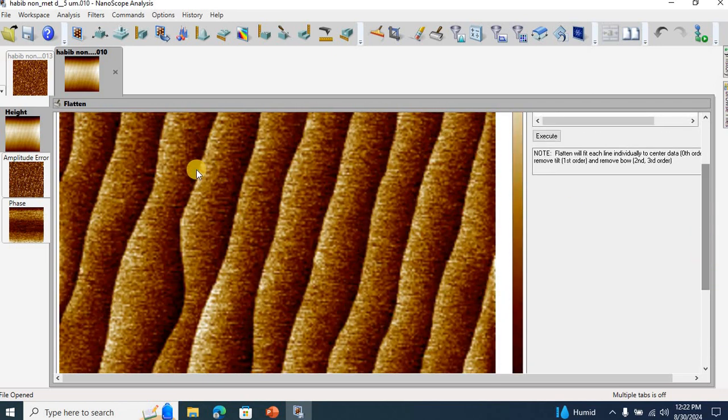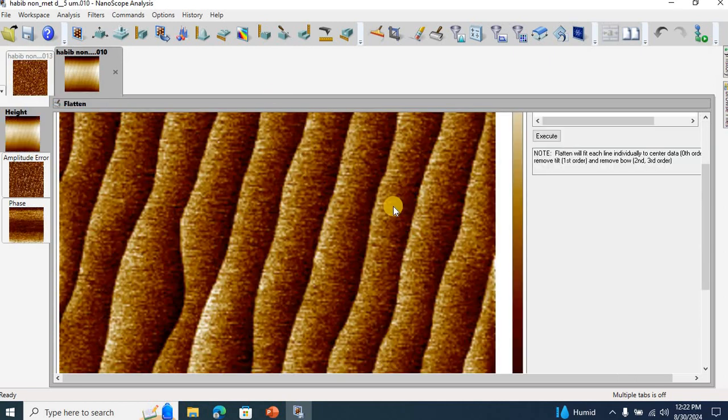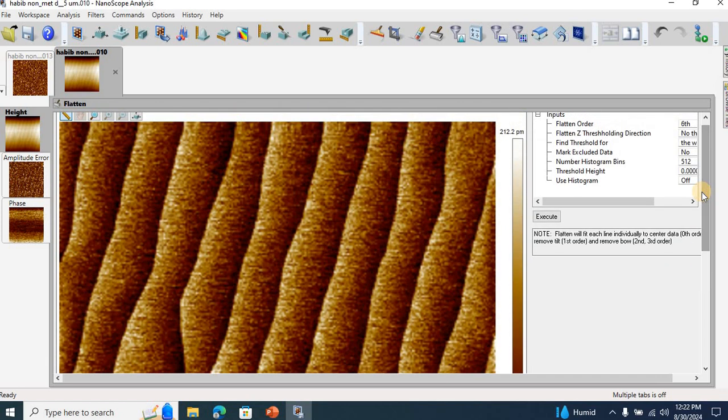So now you see that previously, here is my sample. We can just see points all over the place on top of the surface. But after annealing this sample, and once again I'm going to tell you about annealing of sapphire in a separate video, and I will show you the atomic force microscopy results for after the annealing as well. So after annealing, we get this beautiful step structure for this annealed sapphire substrate.